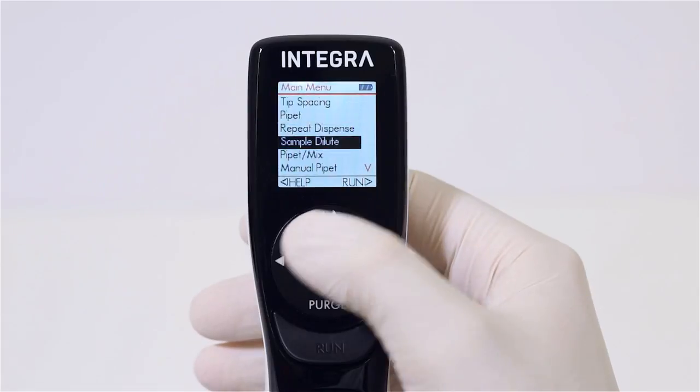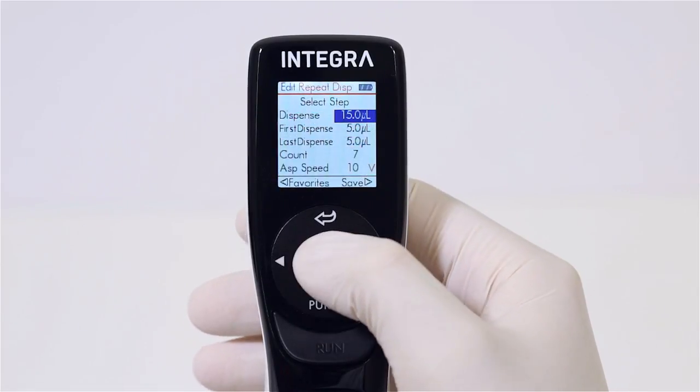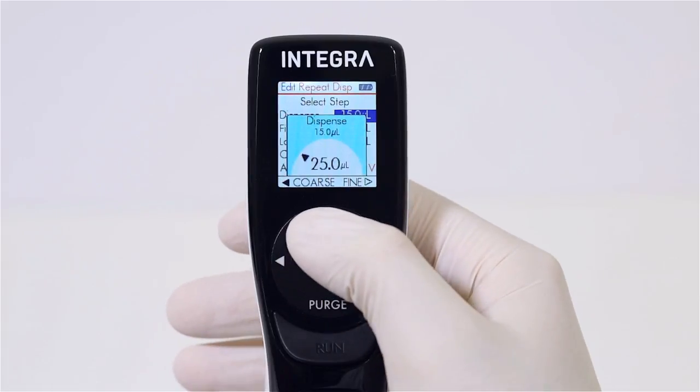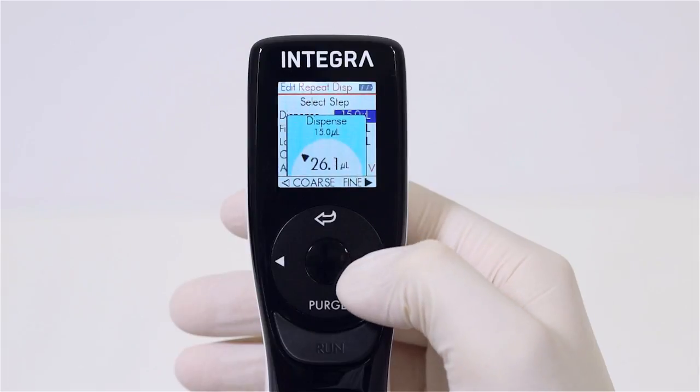Choose your pipetting protocol and set your parameters. Pipetting volumes are easily adjusted using the touch wheel, and can be quickly selected in either coarse or fine increments.